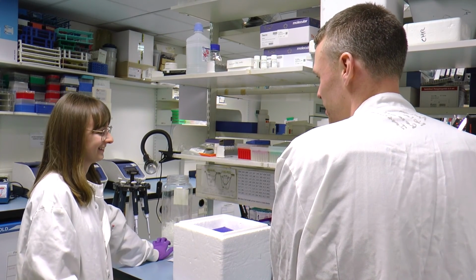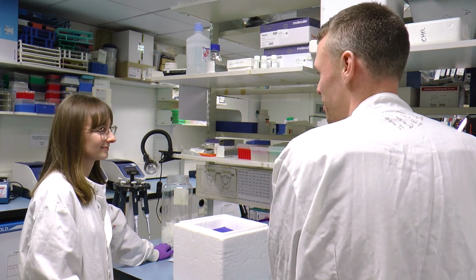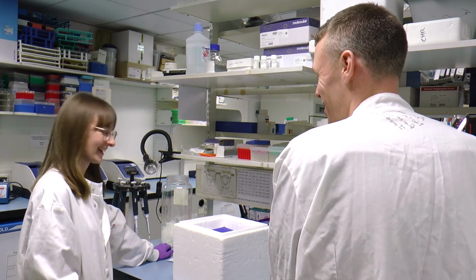So by sequencing the HLA genes to an extent we haven't been able to before, looking at not just the exons but all of the introns and the untranslated regions as well, we've discovered a lot of additional polymorphism that we weren't aware of previously. We're currently performing a retrospective study of patient-donor pairs where we're hoping to correlate any differences we find in these regions with clinical outcome. And in doing so, we're hoping to encourage others in the field to adopt similar strategies to long-read sequencing and HLA typing at the highest resolution. We hope that this will allow clinicians to pick the best donors for their patients.